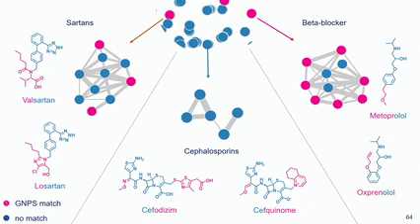Even though what we see in this case is a cephalosporin, so it should be covered, it still can be missing in the public databases. Maybe a different instrument was used or a different collision energy, then we would not get a hit. Still, only 14% were annotated, and it's an Orbitrap instrument, so it's nothing very specific or special in this case, but we still cannot annotate it with the public databases.